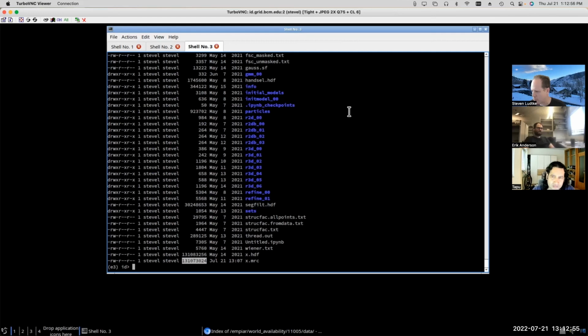The LST mechanism is a way of overriding the header data for cases where it's variable, where it's going to change over time. So for the case of class averages, it really wouldn't make much sense to use an LST representation in the first place. You just put it directly in the header, and the HDF format already deals with the variable sized header stuff itself internally. So there's no waste when you do it that way. Okay, cool. Thanks.